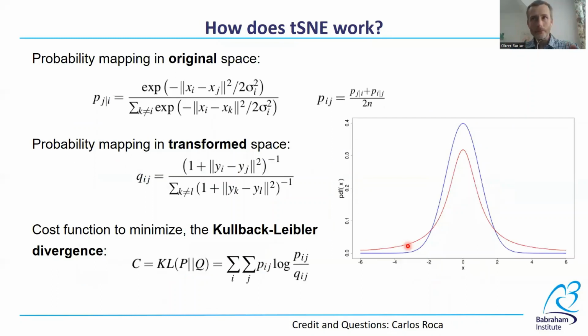Now, before I scare anybody off with the mathematics, I'm not a mathematician. I'm an immunologist. Carlos Roca is a mathematician and invented the statistical test that I'm going to talk about today. I'm just going to try to explain the basis for the test in a simple and hopefully correct way.